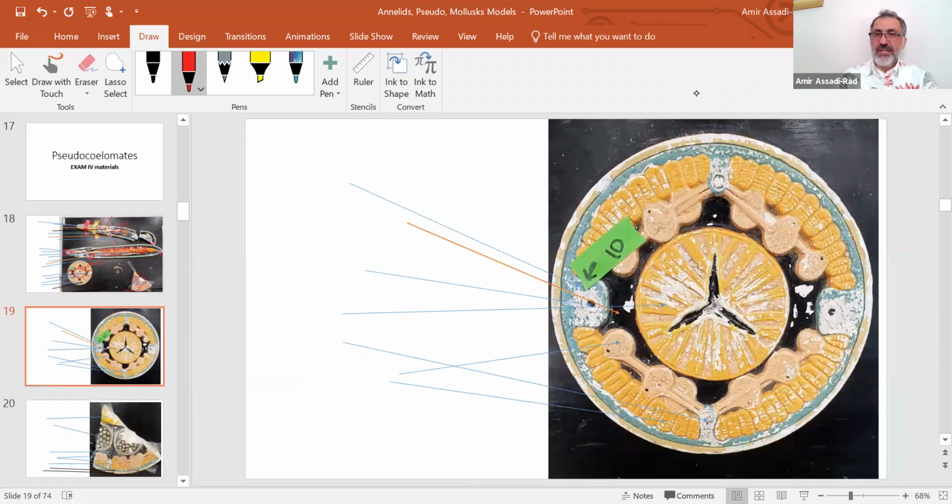Okay, cross section, lateral line, and the excretory canal runs through the lateral line. Nerve cord, longitudinal muscle. The creamish area right here, that would be your hypodermis, and this would be cuticle. And of course, your powerful pharynx.